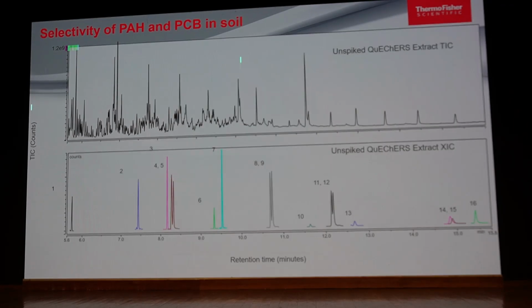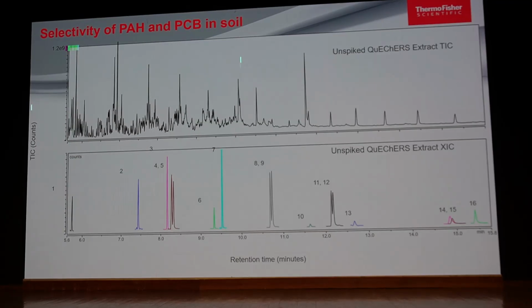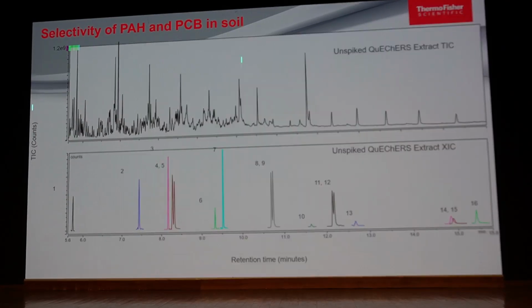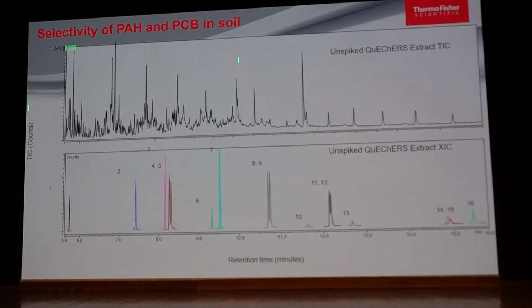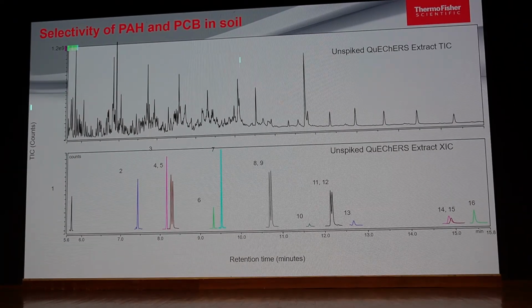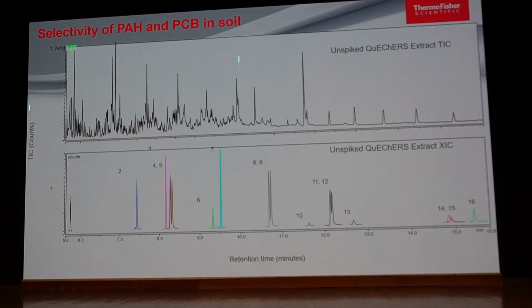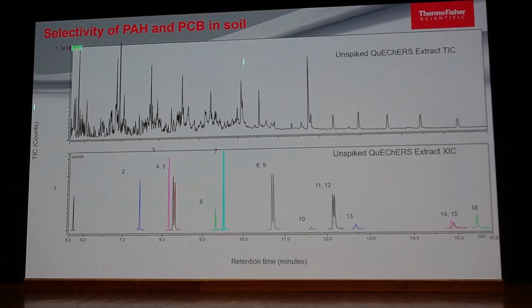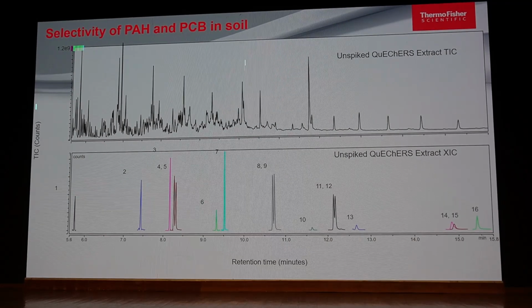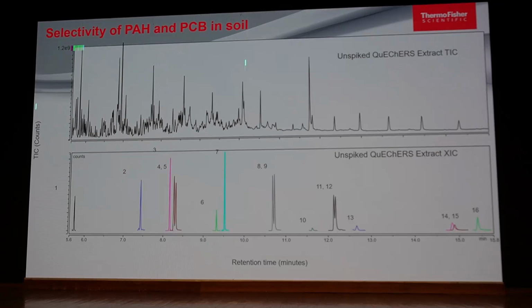But parallelly, if you want to see the untargeted approach, then you may follow the untargeted data processing software called Compound Discoverer, where the software automatically picks up the exact mass and tries to match it with the NIST library or any other available library. Based upon that, you can get the identification of that particular mass, that particular compound in your samples, with the extracted ion chromatogram.